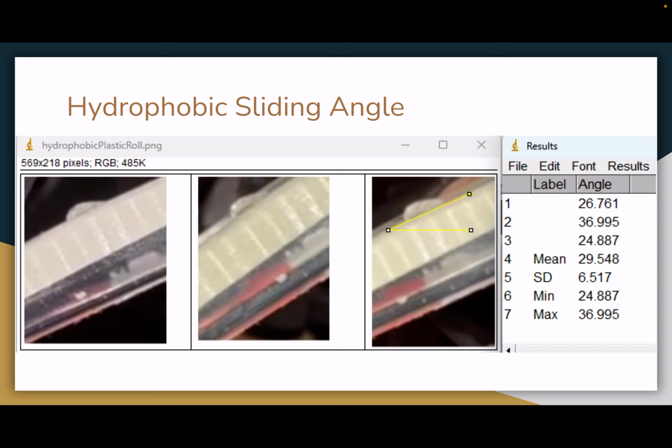The plastic is hydrophobic because most plastics consist primarily of nonpolar hydrocarbon chains. Nonpolar surfaces do not interact strongly with polar water molecules. Because of this weak interaction, water prefers to stick to itself instead of the surface, forming round droplets with large contact angles. This is also similar to the sliding angle measurements: because of its hydrophobicity, water sticks less to the plastic, so it has a tendency to slide off.